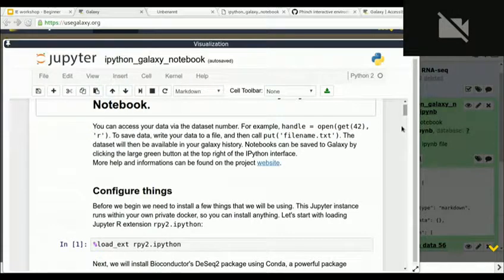And another, this shows a fairly sophisticated example. Sometimes you use Galaxy and you have some stupid text file, and you just want to do some simple operation. Now you can do that. You can just start this and do whatever graph on something. Maybe it's not the ideal example. So for me, this is really one of the most exciting things that happen.